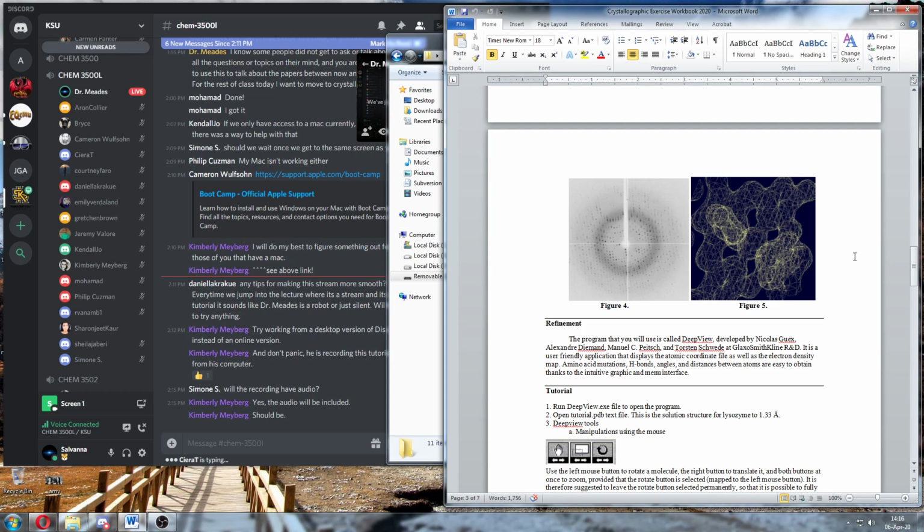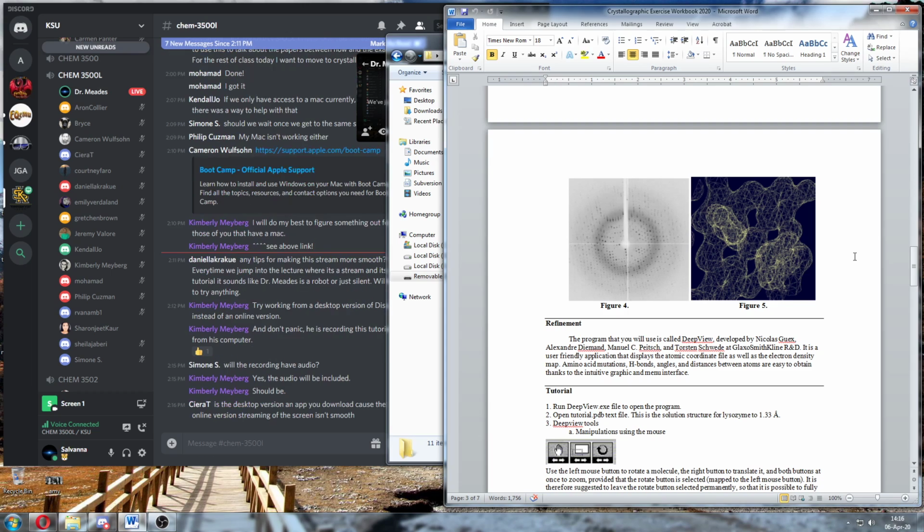Okay, so you don't have to do all that math, but you can take that in a computer program and let it crunch on it for several hours or days, depending on the data set, and you get something like figure 5. Right? You get this cage network back. So what's shown in figure 5 is where the electrons were, right? So where the electrons might have been when the X-rays hit them. Okay? So there are so many electrons and so many molecules in this crystal that we pretty much catch the electron everywhere in its orbit or everywhere in its potential.